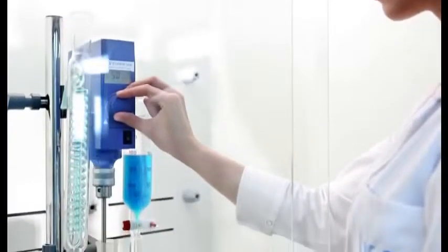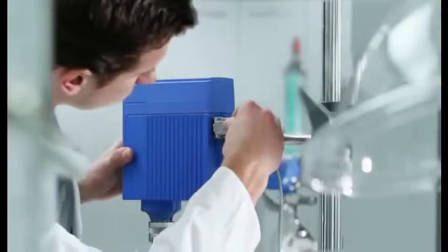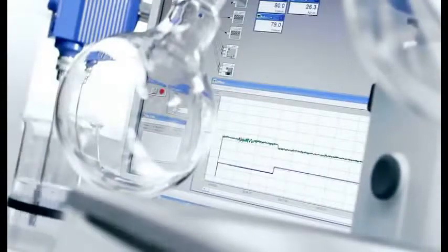Modern ergonomic design, space saving and efficient. RS-232 interface enables PC control, ideal for monitoring and documentation with LabWorldSoft.